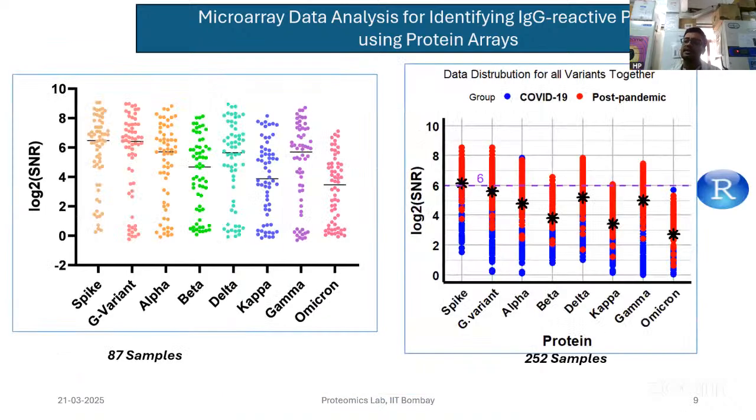So next, there are different trajectories for showing the data. Data visualization is one of the major parts of our projects. So we are using R coding, not only for analysis, that's one part, then visualization. For the major part of the visualizations, we go ahead with R. There are a lot of packages, but let me tell you one package which is very crucial for our analysis to show the best data, which is called ggplot.